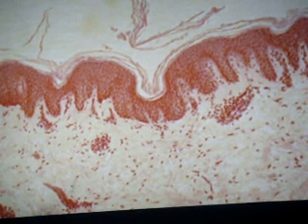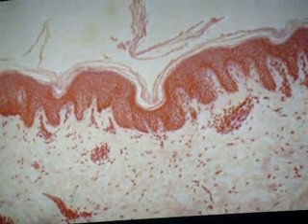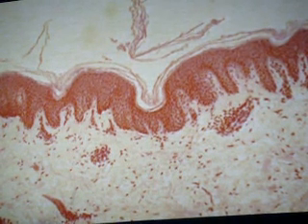But remember, your thick skin is present only where? In the palm and the soles, right? So, I would appreciate if I would be able to see the hypodermis at saka yung dermal layer, okay, of the structure that is being asked to be identified.